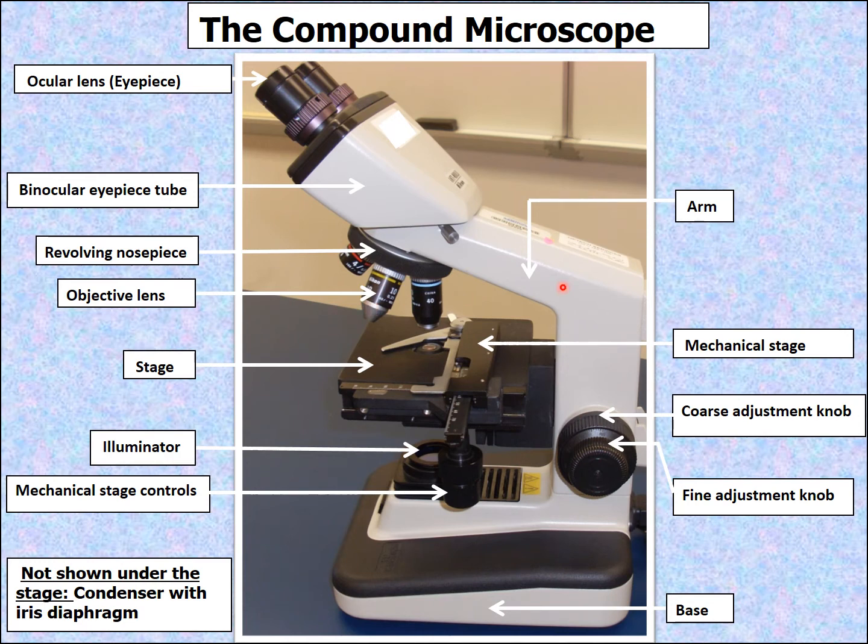Now, I already talked about the arm. The mechanical stage. The stage is this whole flat piece on which your specimen sits.